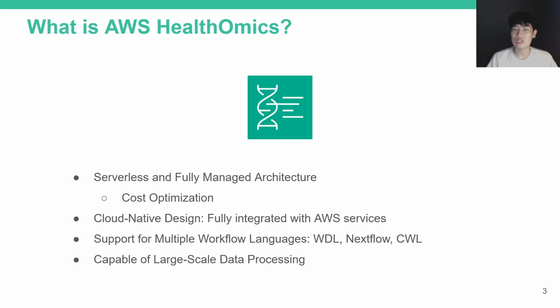And also, HealthOmics has a very cloud-native design and is well integrated with other AWS services like S3 and CloudWatch. Today we are going to talk about only Nextflow, but it also supports other workflows too, like WDL or CWL. And finally, you can run workflows on huge scales with HealthOmics.